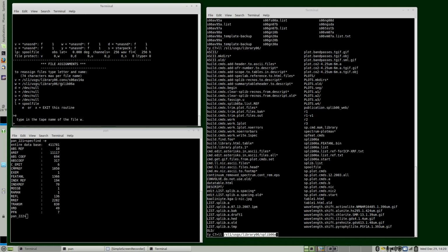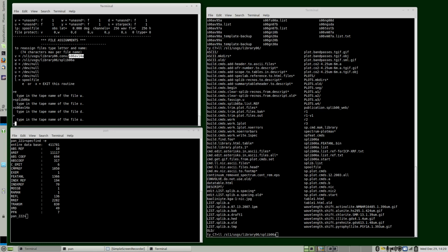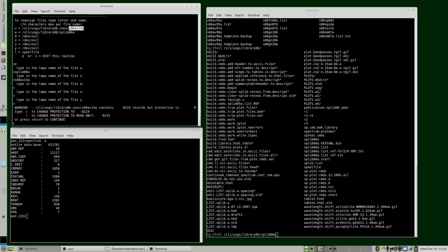Now we need to type in the actual names. The reason why these are separate is sometimes a file name is very long, and if the first 8 characters are unique, we can just take those characters, and that's the name that'll be used in the history.